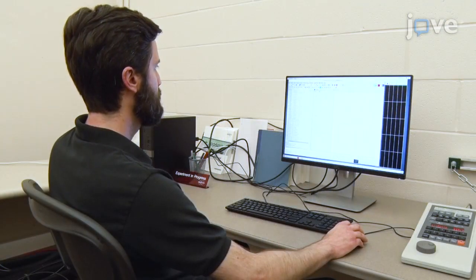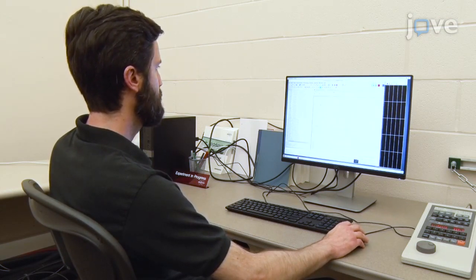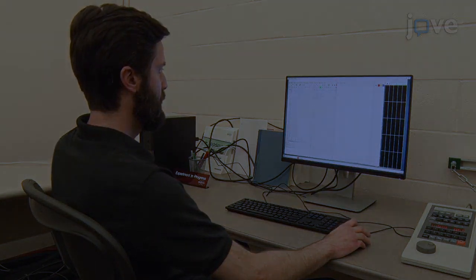Set up transverse relaxation-optimized spectroscopy with hetero single quantum coherence spectroscopy, and proceed with recording a reference experiment at the atmosphere.